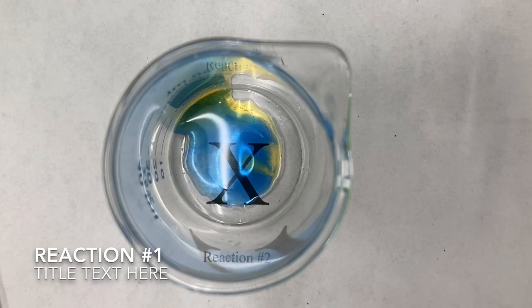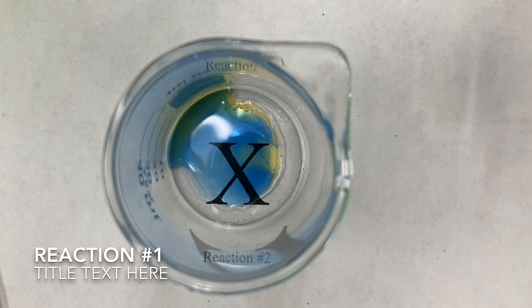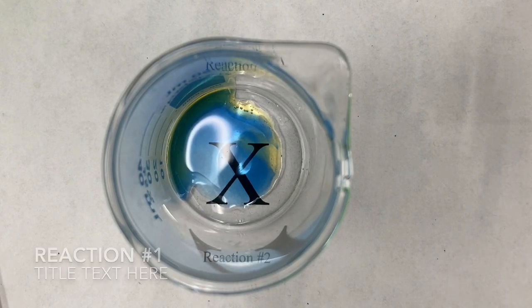Okay, we see that adding hydroxide here has turned our chemical blue. So which direction does that prove equilibrium shifts?